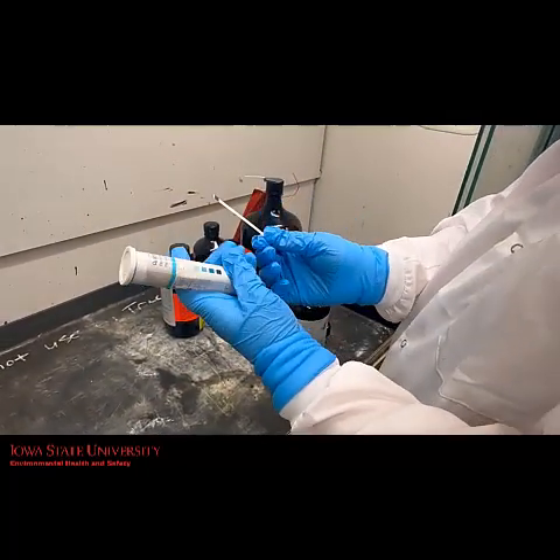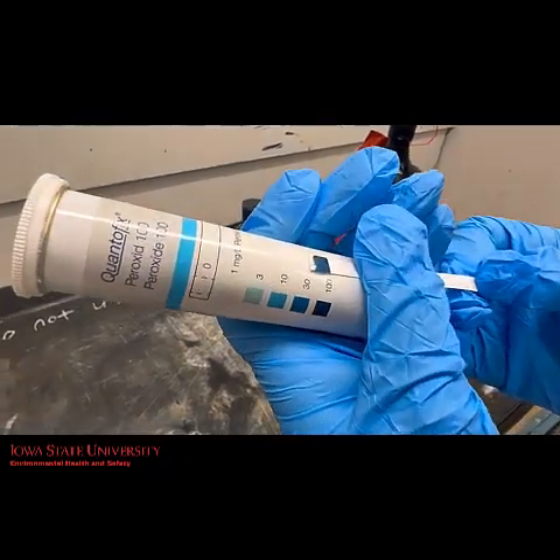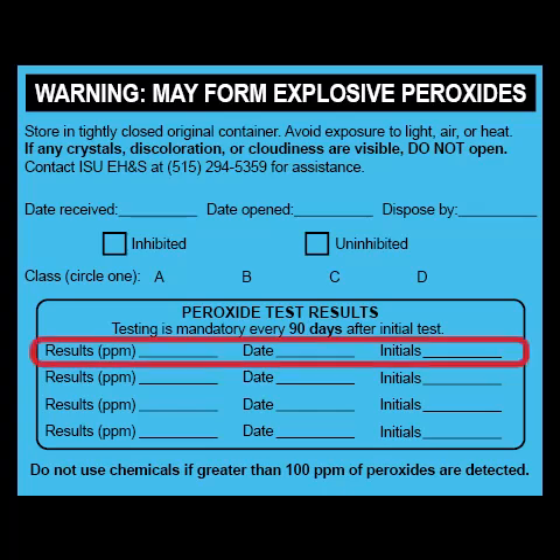Next, compare the test field with the color scale. If peroxides are present, the test field will turn blue. Record the peroxide level, date, and your initials on the PFC label.